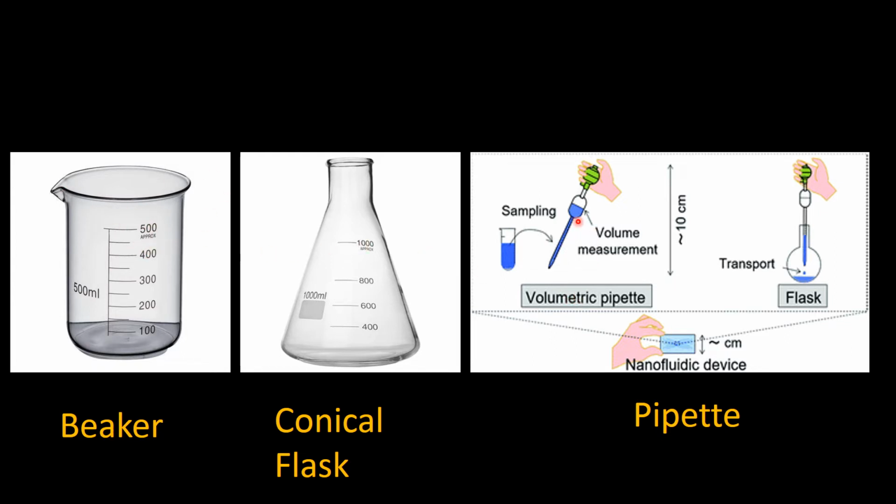One of the most important apparatus in titration is the pipette. In a pipette, both ends are open. We will close one end by putting a sucker on it, and a pipette is mostly calibrated in 10 ml. When we have to transfer a solution from one beaker to another, from one test tube to another, or from one conical flask to another, what will we do?